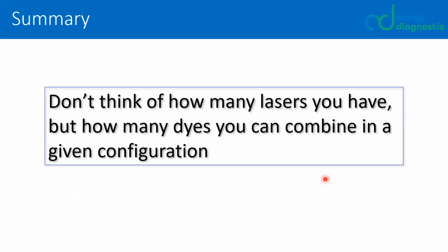And don't forget, you don't need to think about how many lasers you have, but rather how many dyes you can combine in a given configuration.